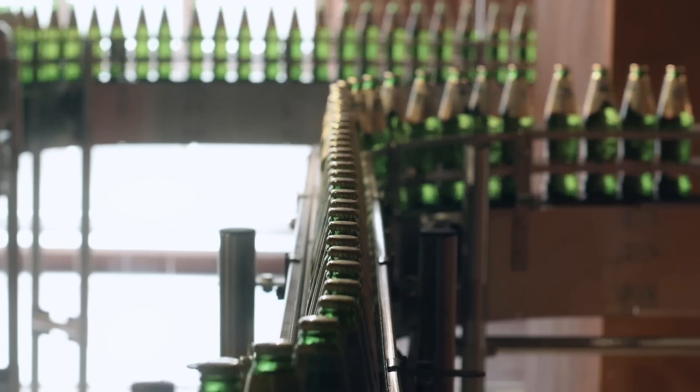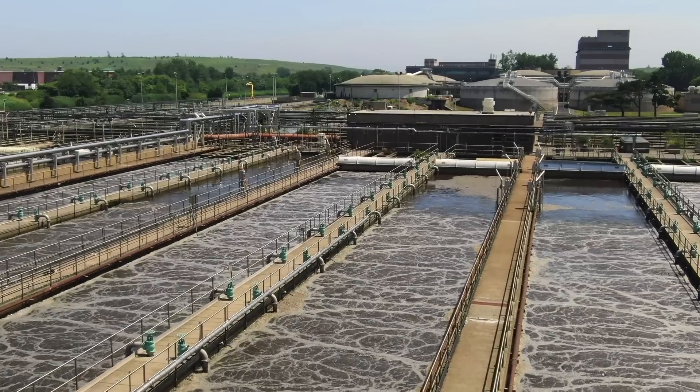Additional applications include industrial process water, raw water influent and filtration, and wastewater effluent applications.